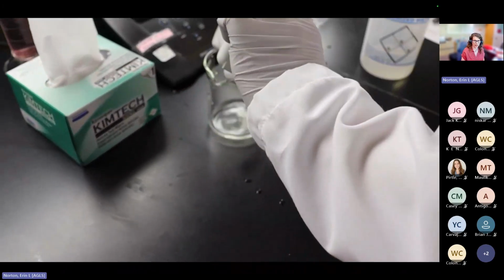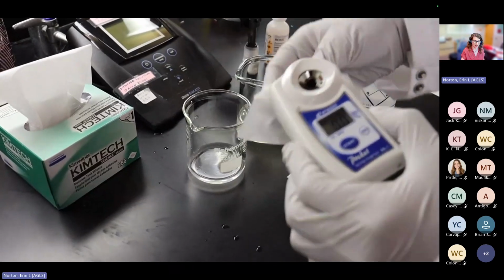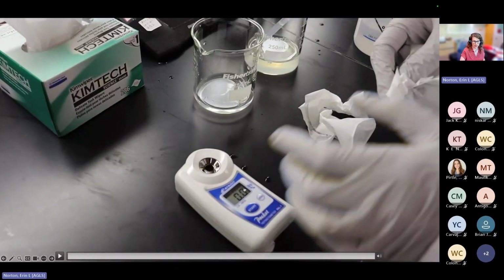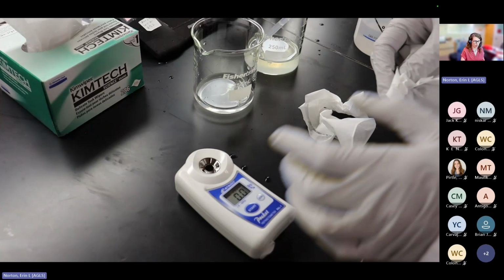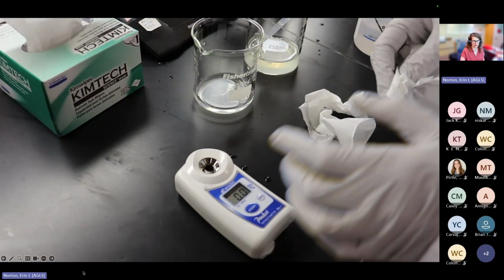So we've just checked. We have a 0.0 when we have just deionized water in there. The one thing I want to say here is if it didn't read 0, you would zero it out using the little calibration button, the 0 button, and double check it again with water. Okay, if you ever need to calibrate and you hit the little 0 button, check it with a second sample of deionized water to make sure that you are truly at 0.